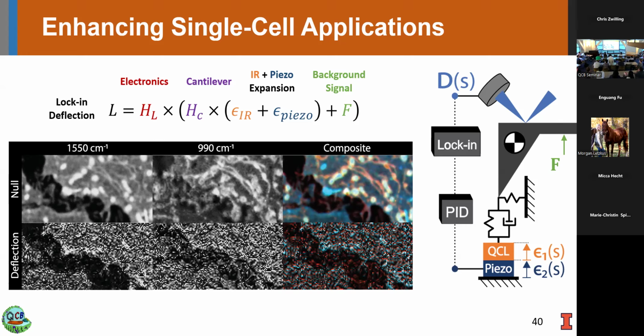Another technique, existing AFMIR. So how much better is the new null deflection method on these control samples, in terms of comparison to FTIR? It really depends, but I have another data set that shows the AFMIR technique will have diminished peaks. They'll get saturated in other ways, because null deflection maintains zero deflection. But when operating in resonance, you can see the peaks actually get saturated. So it does show good agreement in certain cases, and I have that data in another paper. Okay.